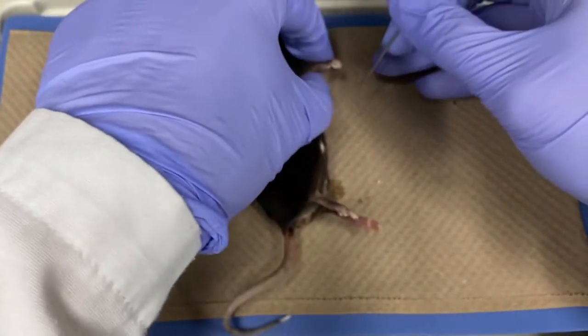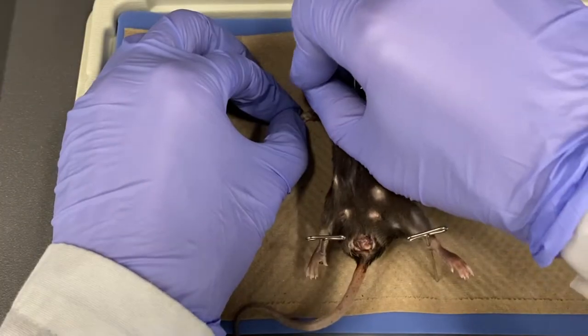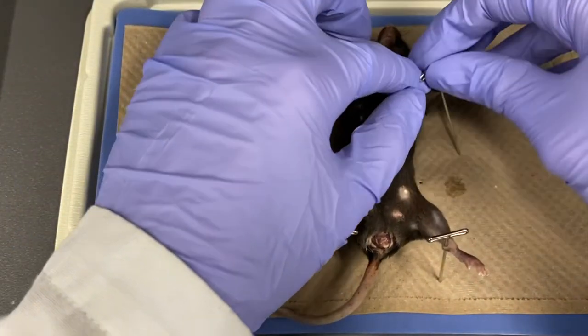Let's now prepare for dissection. Use four pins to pin down the mouse, belly side up, with the forelimbs stretched out as much as possible.